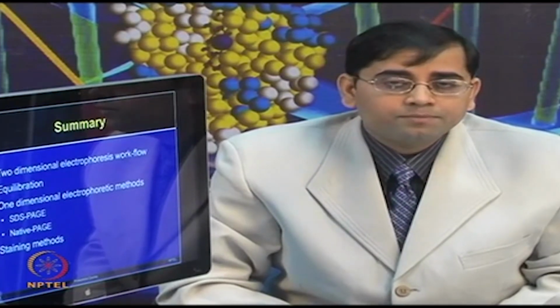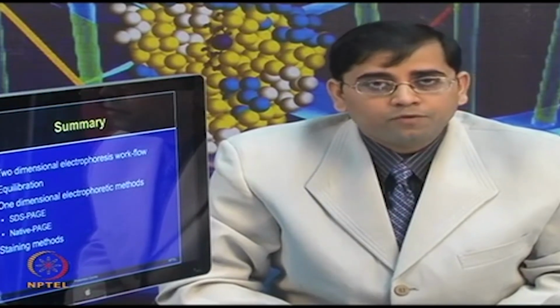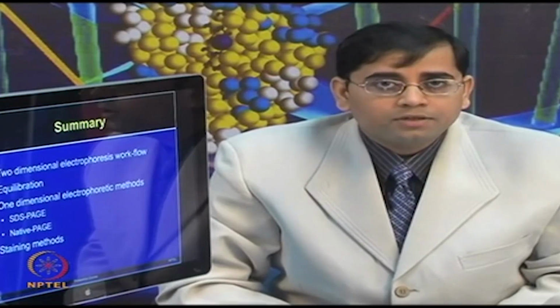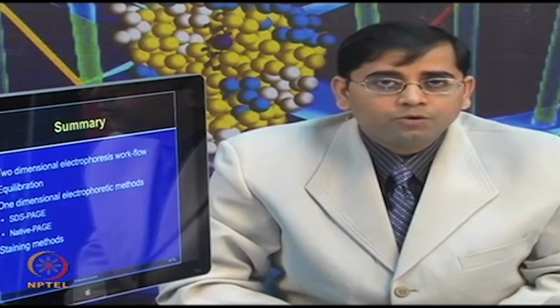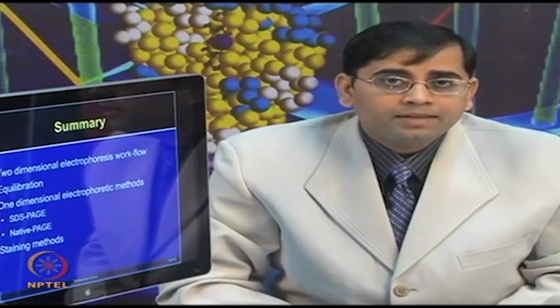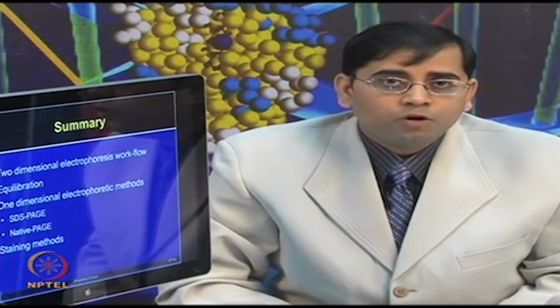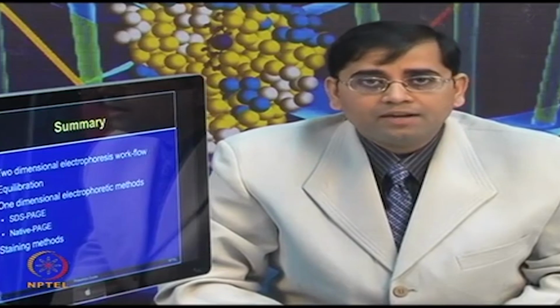In the next lecture, we will continue with this workflow of performing two-dimensional electrophoresis. We will talk about a few more sensitive stains available, how to use those, then how to analyze the images by using different software, and then to perform the statistical analysis of those, so that we can identify the interesting protein spots for a biological question.